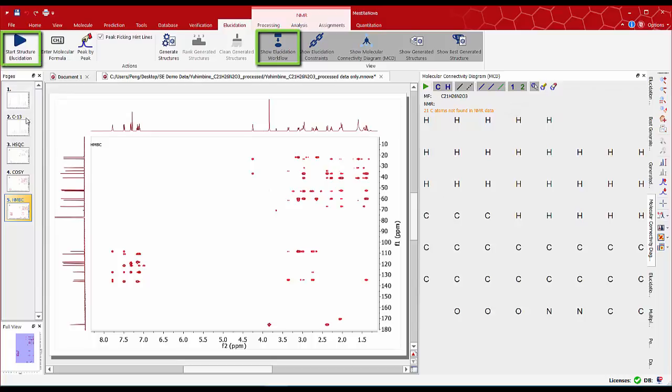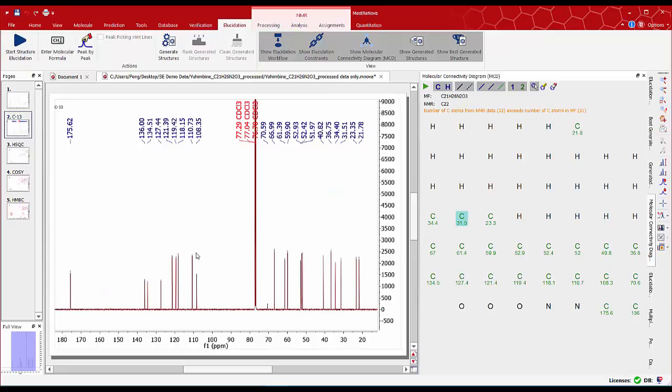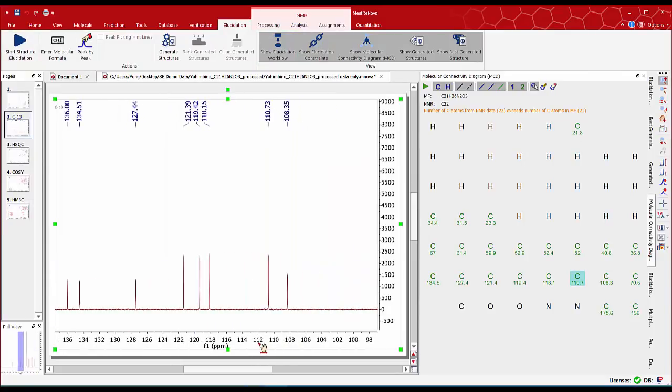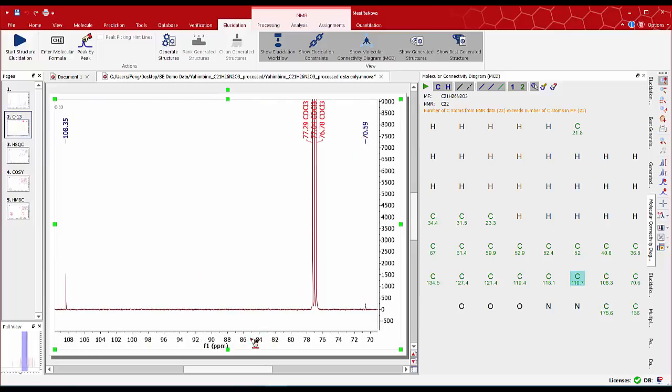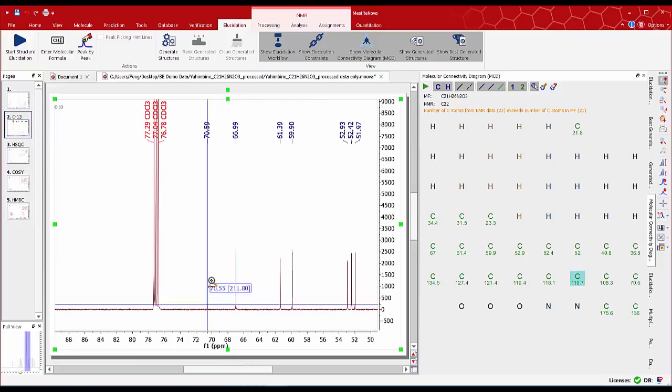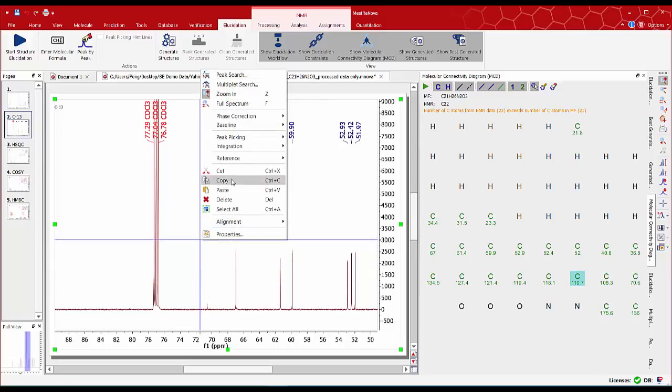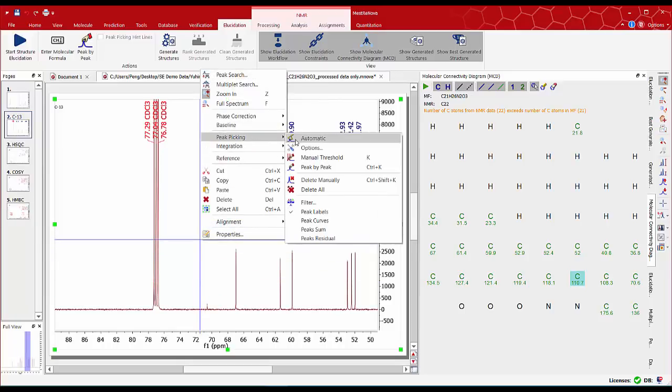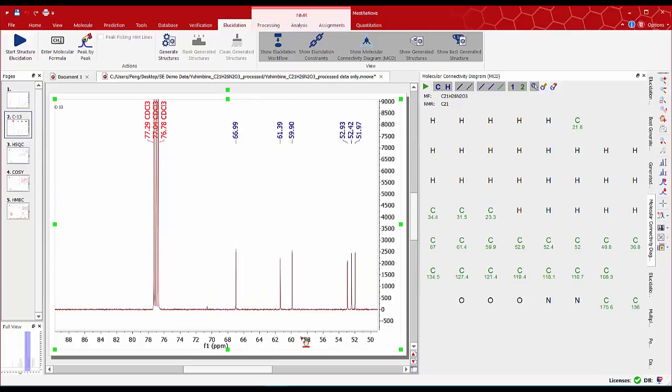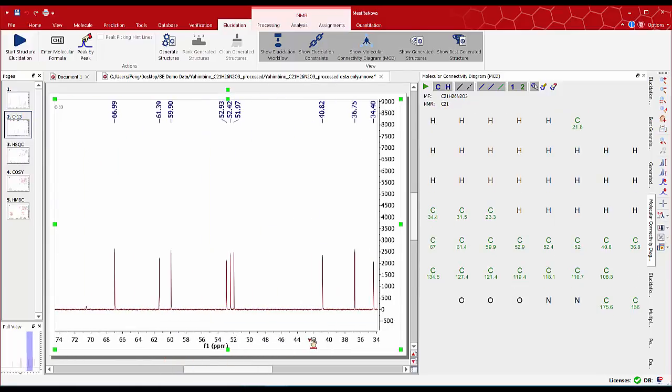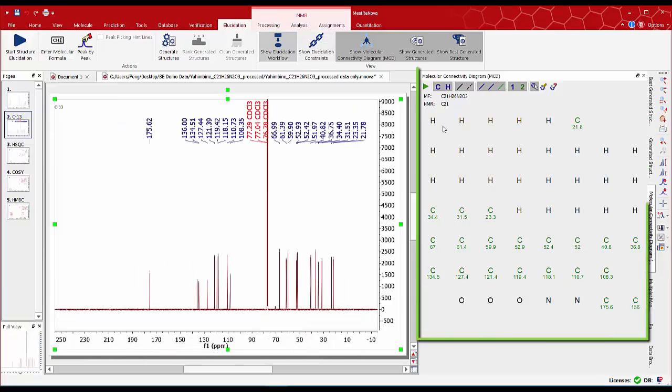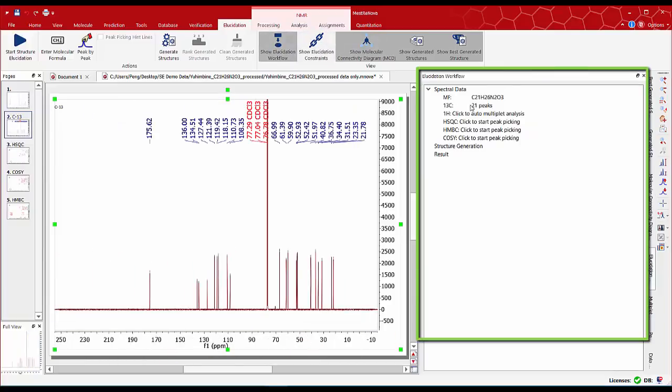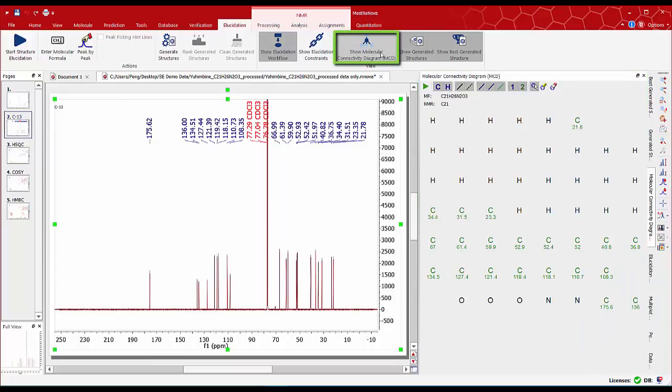On the workflow panel click on the carbon-13 auto peak picking. It is very important to make sure that peaks are properly picked otherwise we have problems in the subsequent steps. Make sure there are no artifacts, no impurity peaks and peaks have been picked correctly. On the MCD panel we see that we've got 21 carbon-13 peaks picked and we can see them now in green with their chemical shifts.